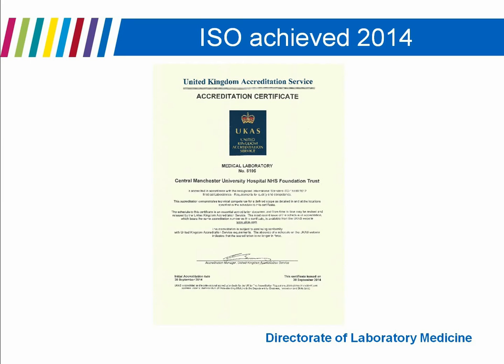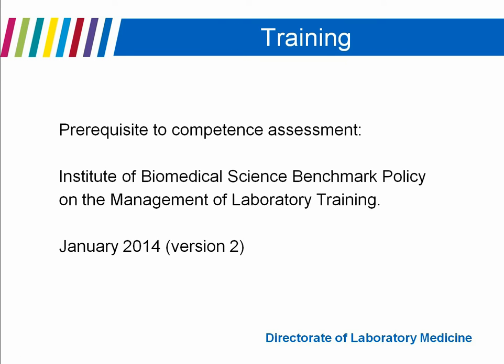It's important to make the distinction between what is training and what is competency assessment. And I would refer people to the Institute of Biomedical Sciences guidelines, benchmark policy on management of laboratory training. And that outlines the roles and responsibilities and governance arrangements for training in the lab. And it also makes a distinction between having a training policy as well as a training program. And that was published in January 2014.